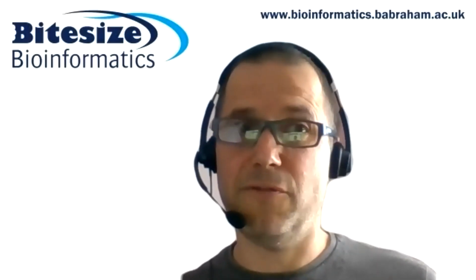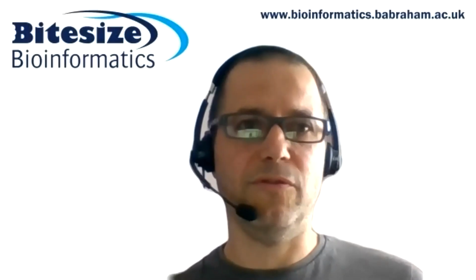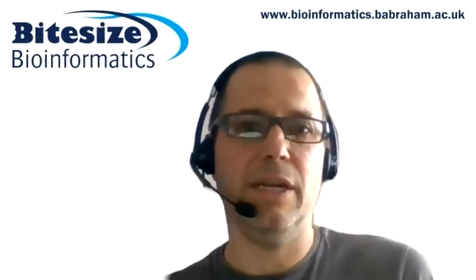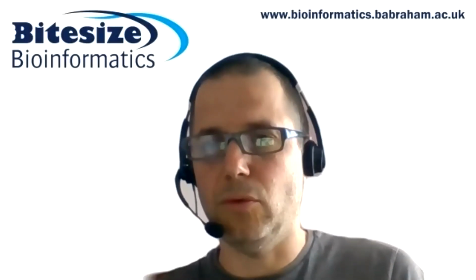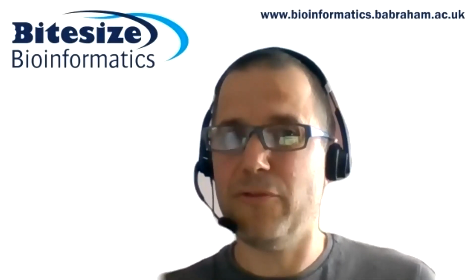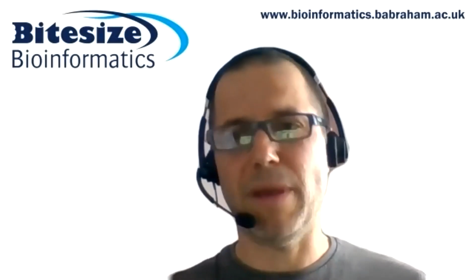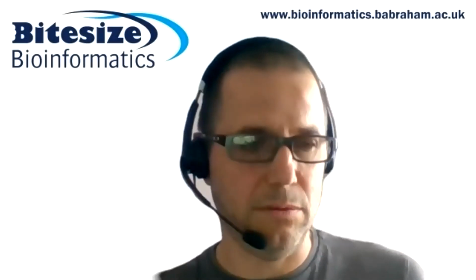SeqMonk is free software, so it's released under the GPL license, so it's available for academics or commercial people to use with basically no restrictions on its use on any kind of data without having to pay us anything or get permission to do that. And it is a cross-platform application, so I'm going to be running it on a Windows machine today, but there is a Mac version and a Linux version, and they look and work exactly the same, so there's basically no difference between them.